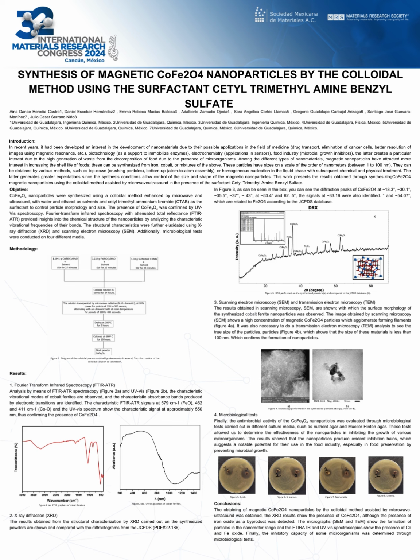And for conclusion, magnetic cobalt ferrite nanoparticles were obtained using a colloidal method assisted by microwave and ultrasound. XRD results confirm the presence of cobalt ferrite, although iron oxide was detected as a byproduct. SEM and TEM show particles in the nanometer range, and FTIR and UV-Vis spectroscopies confirm the presence of cobalt and iron oxides. Finally, microbiological tests determine the inhibitory capacity against certain microorganisms.